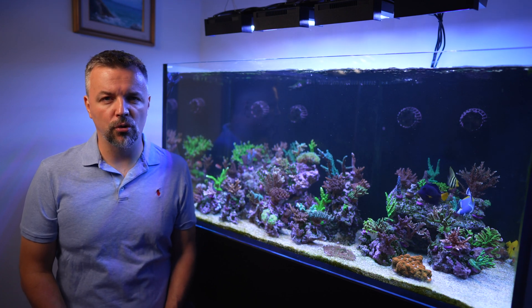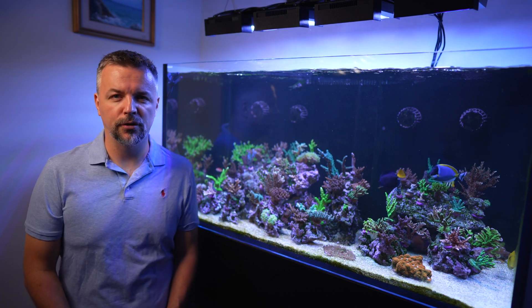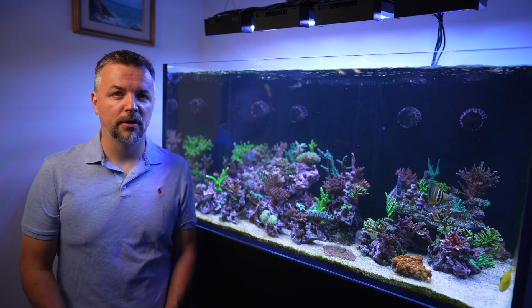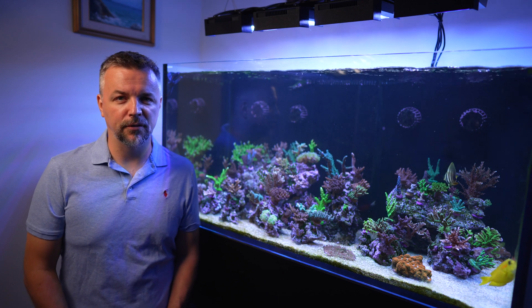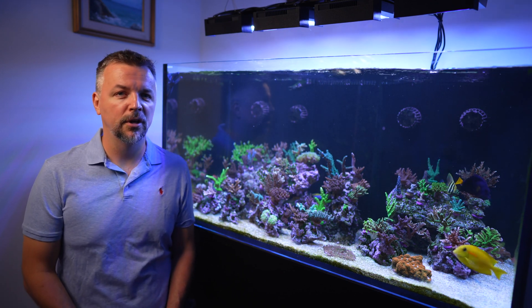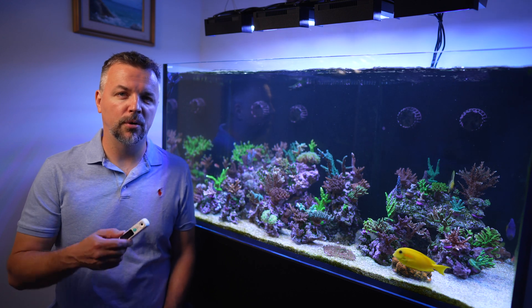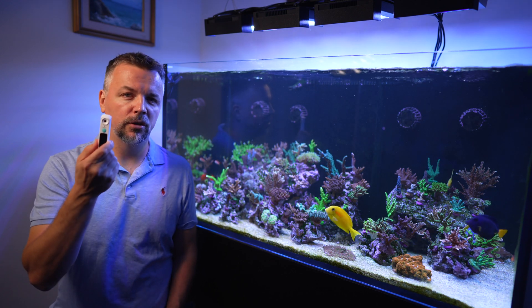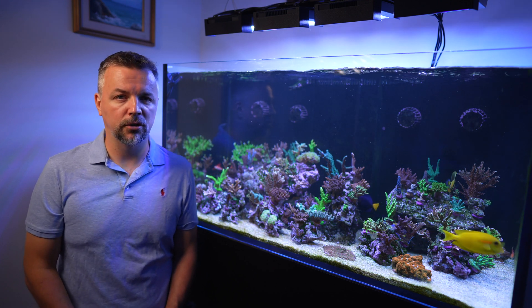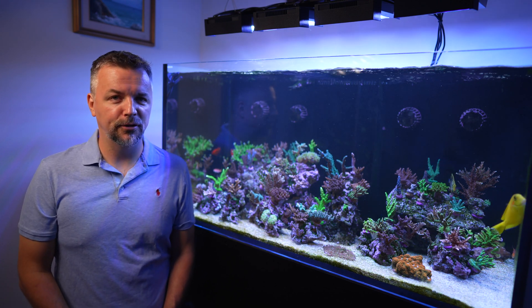Welcome to another episode of Treasure Quarals. Those of you who watch this channel know my love for refractometers and anything that has to do with specific gravity. I've done several videos on the subject and today I'm going to do a product review of this digital refractometer by a company called FJ Dynamics Technology. So let's dive right in.